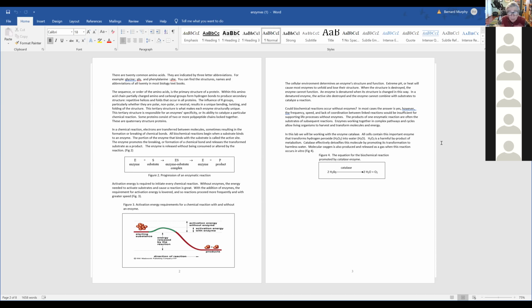It fizzes. Yeah, it fizzes. And that's because you have catalase in all of your cells. You cut yourself open, you break open cells. The catalase falls out of the cells into the open wound. And when you pour the hydrogen peroxide in, your own catalase breaks it into water and O2, which is where the bubbles come from. So at the same time the hydrogen peroxide is killing the bacteria, your own catalase is converting it to water and O2. And that's why it fizzes.